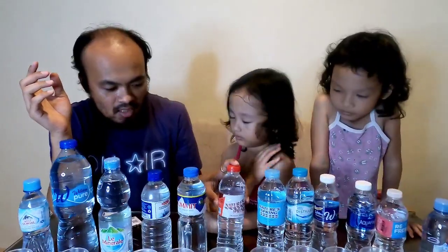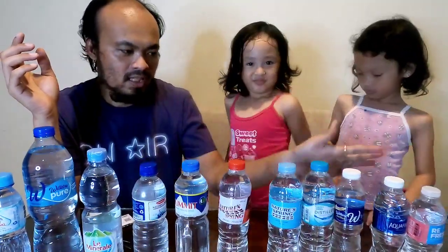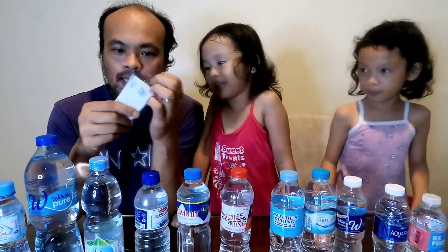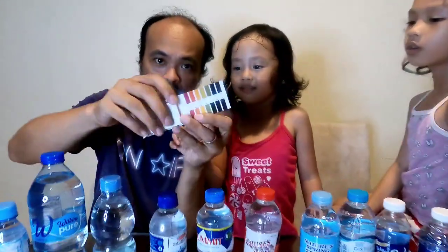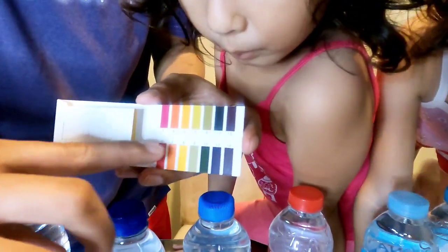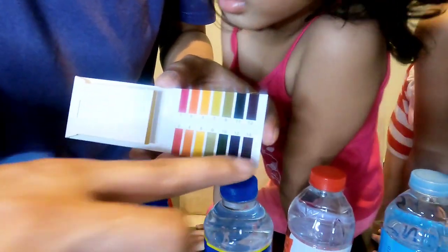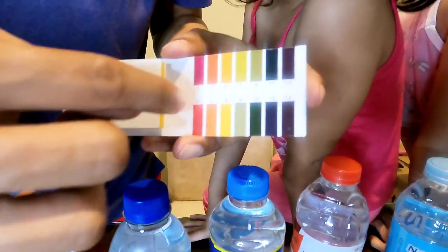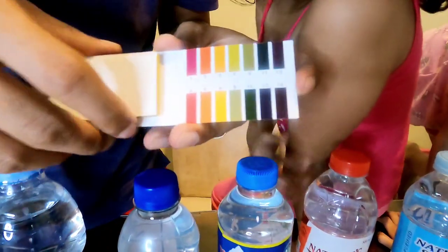This one is an example of alkaline water which says the pH level is 9, so we're gonna check if it's really pH 9. For the other brands, we don't know their pH level. We're gonna test using a pH paper tester. On the scale, 7 is neutral, 8 to 14 is alkaline, and 6 to 1 is acidic.